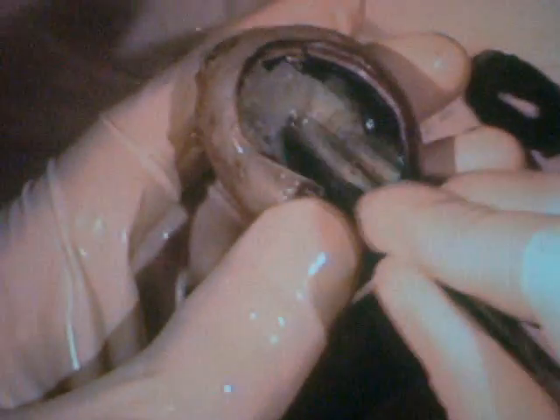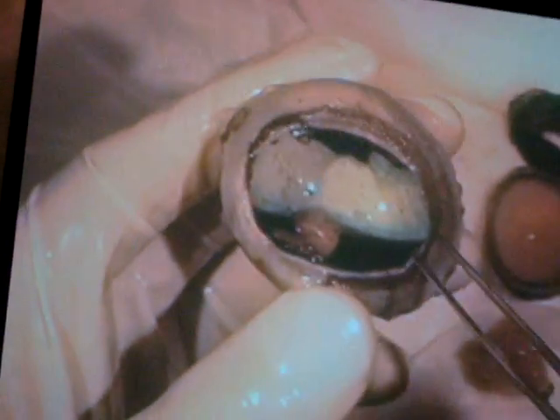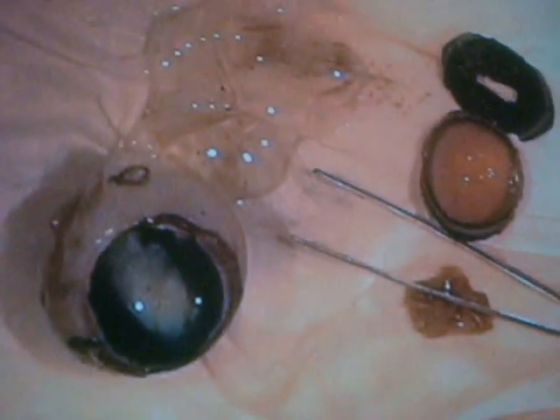Looking further in the eye, we see the retina. The retina is the inside layer of the eye, kind of like the movie screen that you see in front of us in this room.